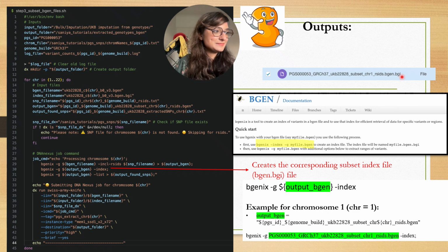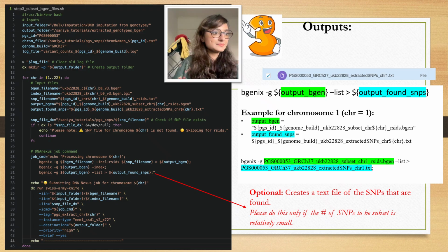That's what it's doing for the file that we've just created. And the semicolon means there's a sequence of commands to run. On the command line, this would be one line, it would execute, then this would execute next, and then this one.